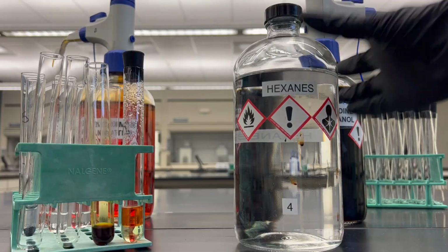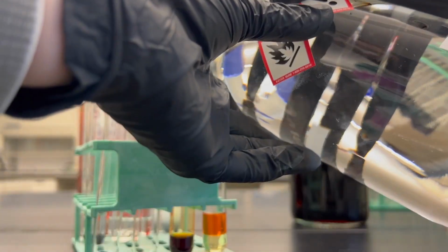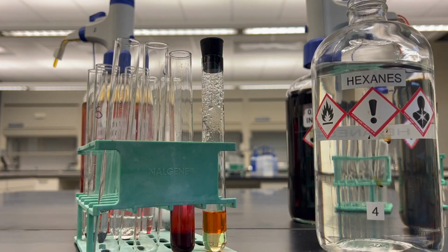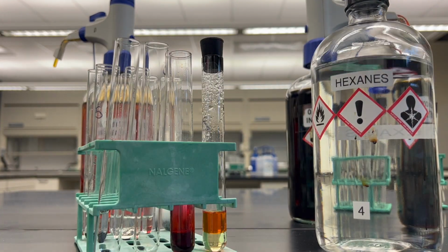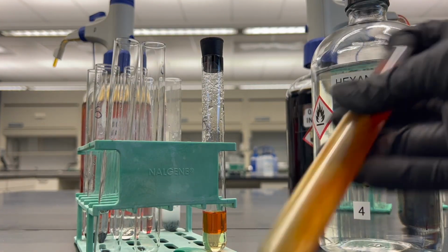Iodine. I'm going to add hexanes to it. Cap it, and we're going to shake it vigorously.